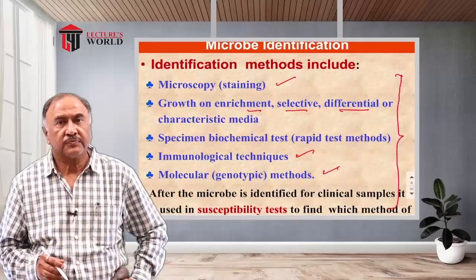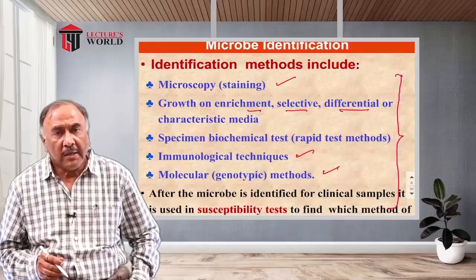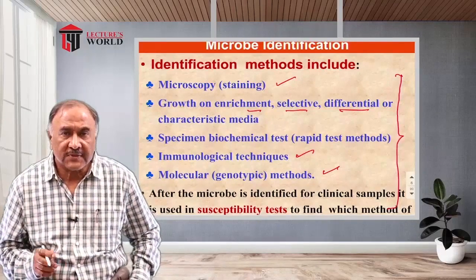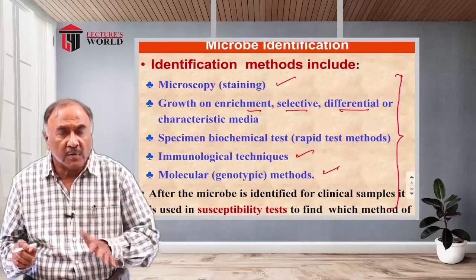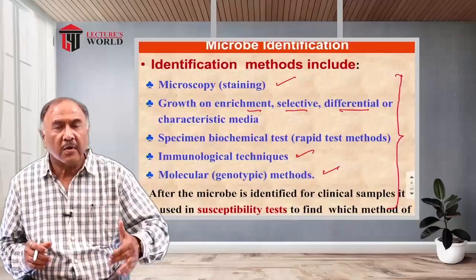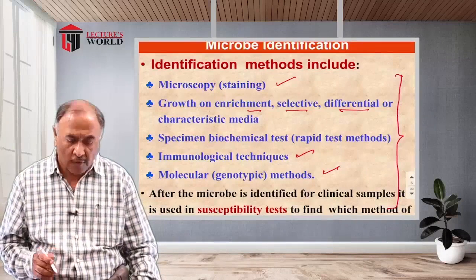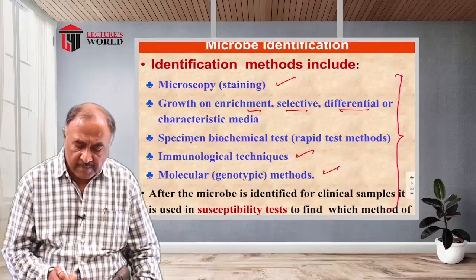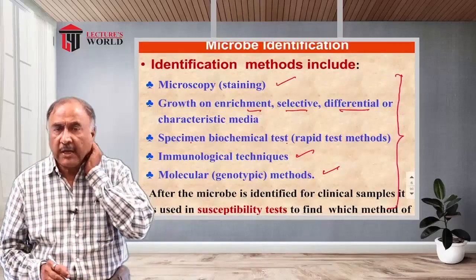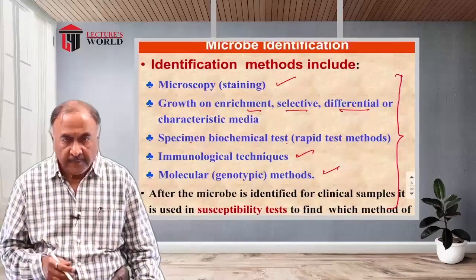Once we have been successful in isolating these organisms, and have been able to separate them from the other non-target organisms, or I would say contaminants, then we go for biochemical tests. It can be rapid test methods or conventional methods.